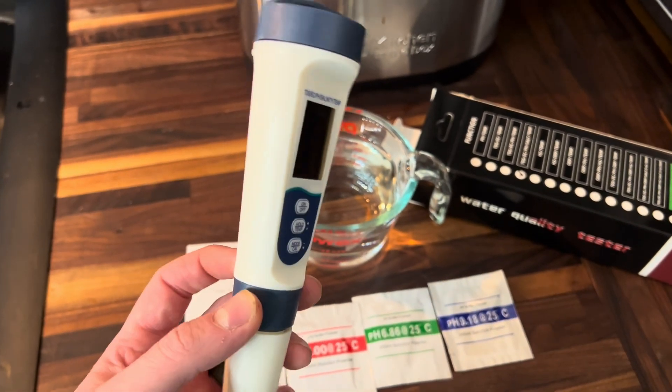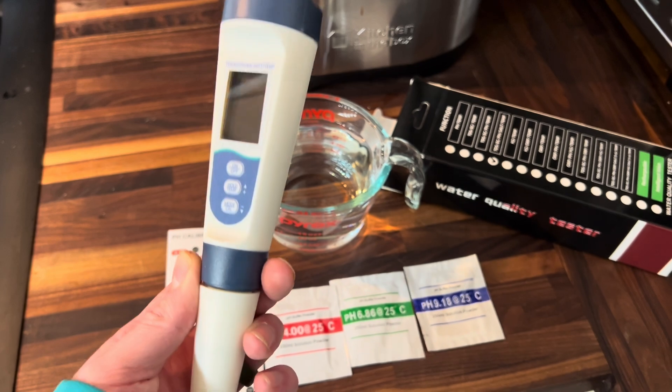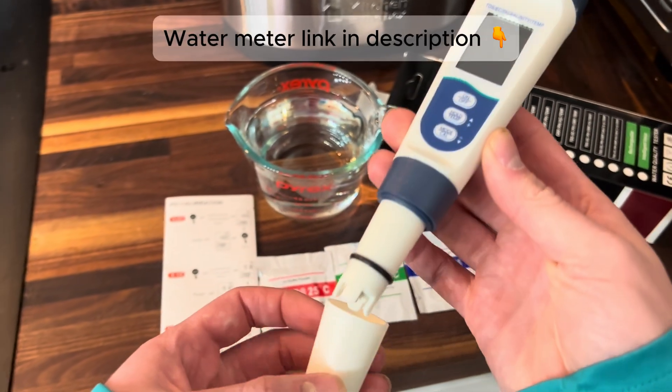Hey friends, today we're going to be calibrating this — pH calibrating — and I'm also going to show you a few things that you should know about this water quality tester and water quality meter.